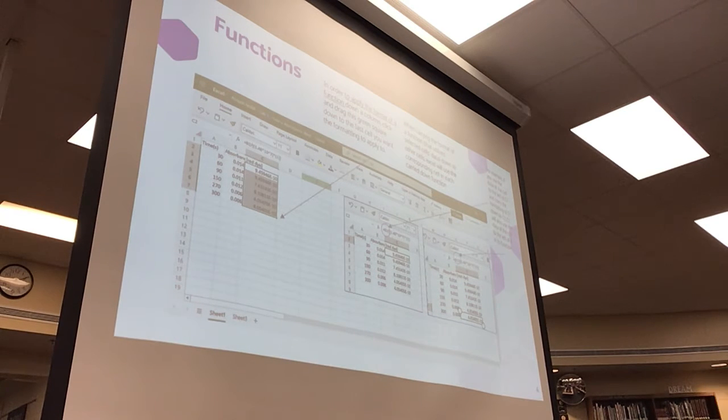So this will help you reduce the amount of time that you use whenever you're doing calculations in the lab, not having to do the natural log of every single one of your data points. And that's about it.